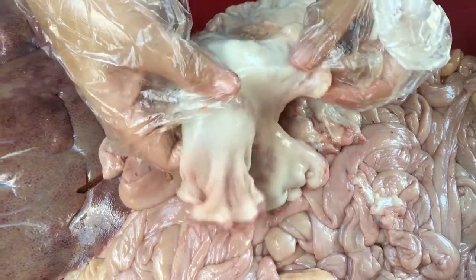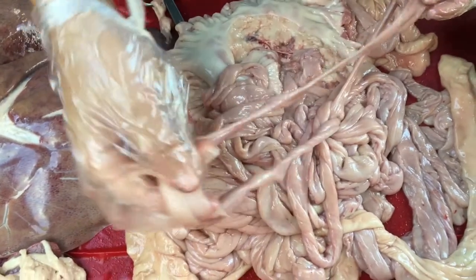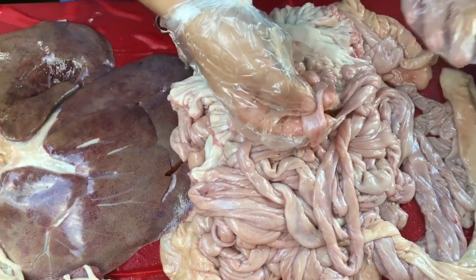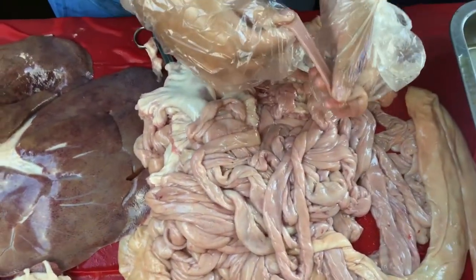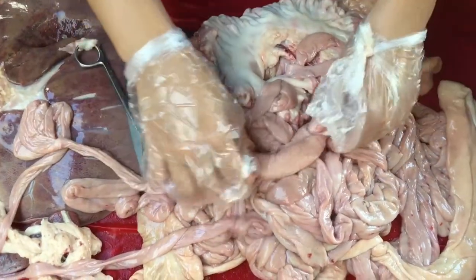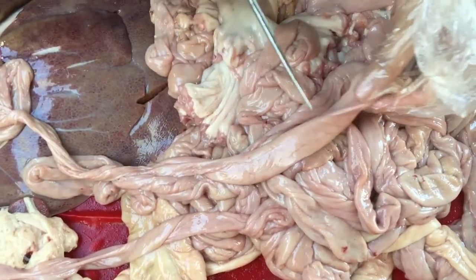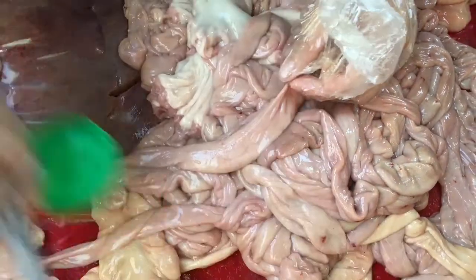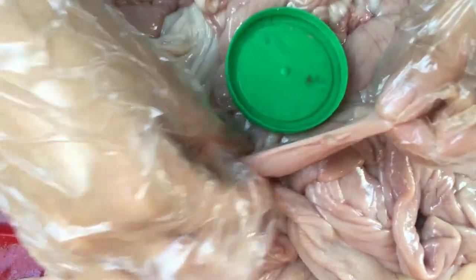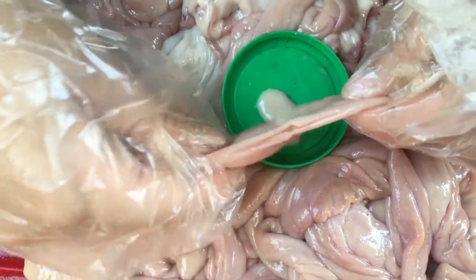The very last portion of the small intestine is the ileum. I cannot show you the ileum itself, but there is the ileum and the large intestine. In the ileum, there is a sphincter valve, a junction where the ileum dumps into the large intestine. And see the chyme inside the small intestine. As you can see, there is this white color here. These are the chyme.